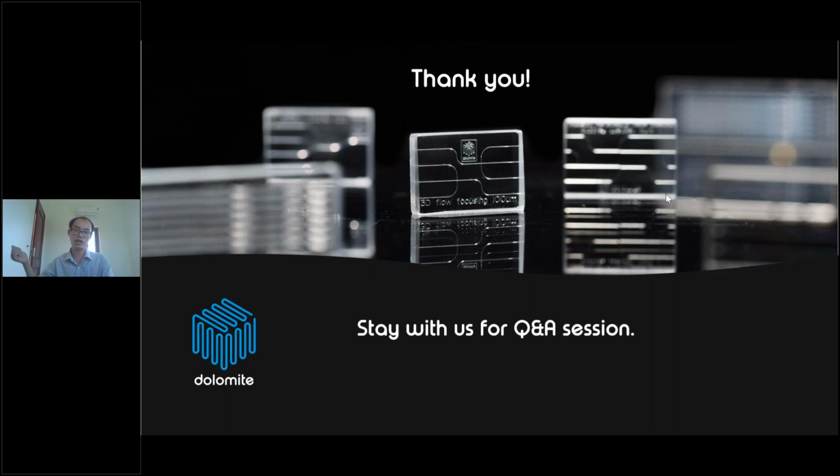Otherwise, you can do it by a batch method, selecting samples by automated collection and doing the post analysis. Otherwise, you can connect online or inline with the other equipment as well. It's no problem. I hope this helps.